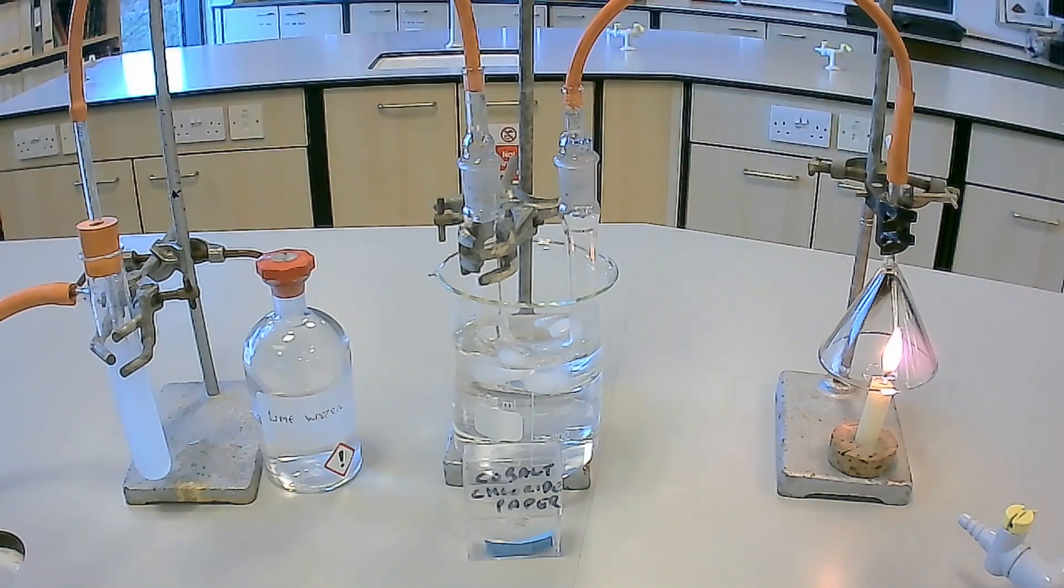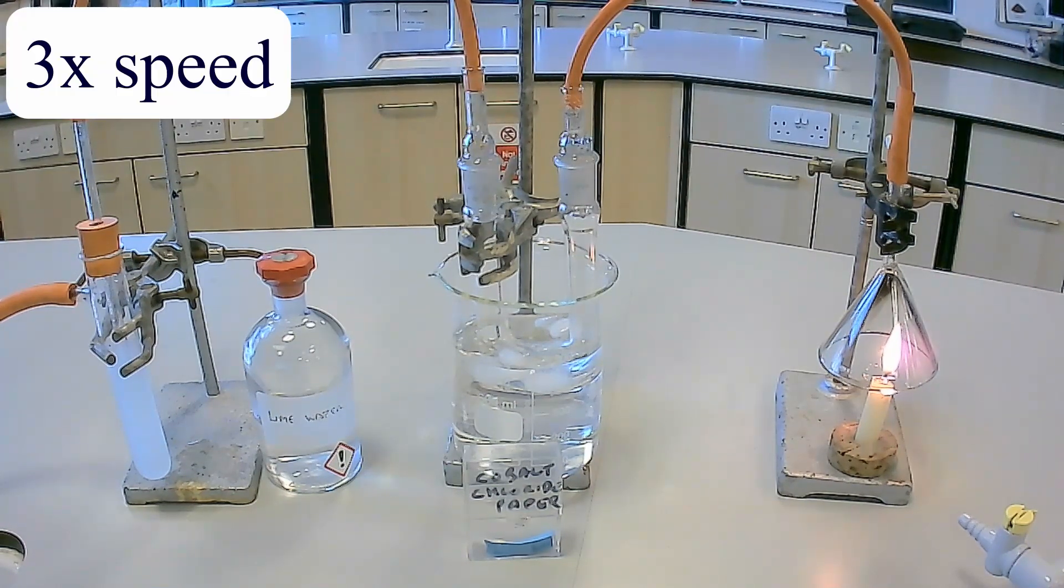In the U-shaped tube, the cobalt chloride paper is testing for the presence of water. As the gases are drawn through the U-shaped tube, when they get to the portion of the tube in the iced water, the gases cool down.